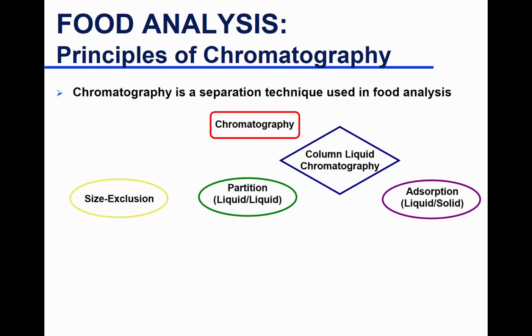And then for the mode of separation, you have 3 modes of separation, and under adsorptive you have further modes of separation. You have size exclusion chromatography, where your separation is based only on molecular size. And you can also hear gel permeation is also size exclusion. So if you hear gel permeation or gel filtration, this also means size exclusion.